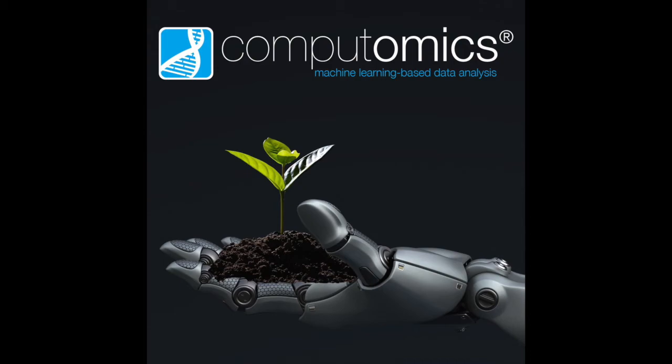So we have worked with sequencing providers, and we have worked with teams that want to link to a sequencing provider to make that data upload so easy that essentially the analysis team never really even has to handle the data files. They get a message that their data is available and already analyzed for them. And that really streamlines things across large analysis organizations, or even just for any client of the sequencing provider. Have you also seen that?